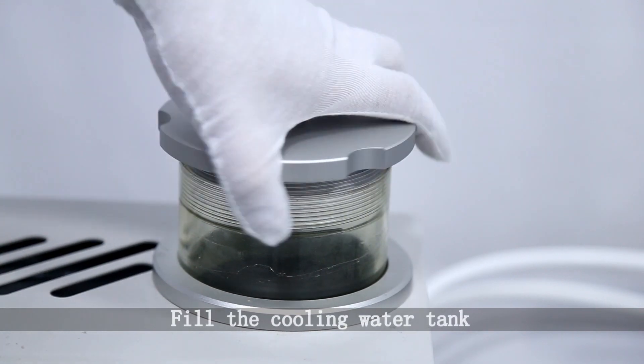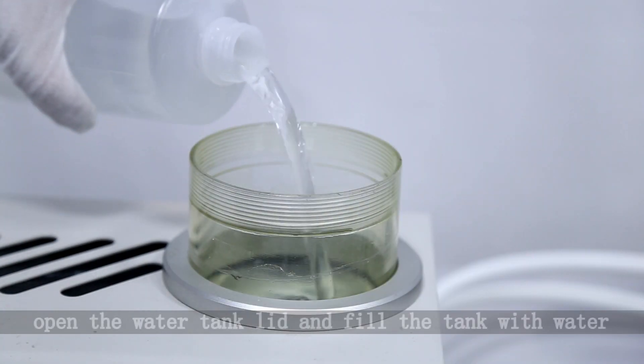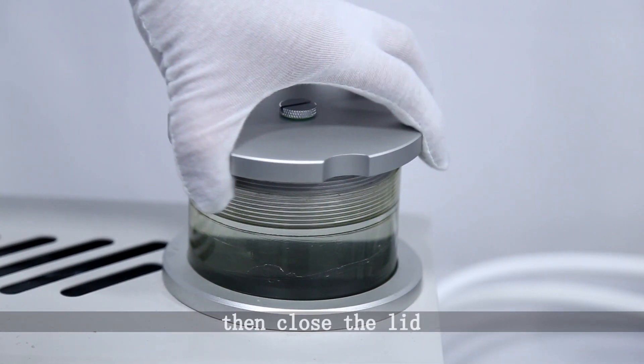Fill the cooling water tank. Open the water tank lid and fill the tank with water, then close the lid.